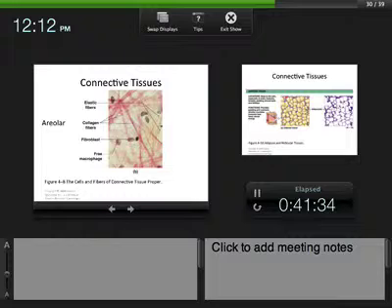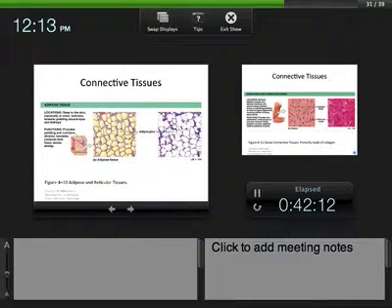We have fibroblasts, some macrophages. There's a whole host of different cell types that you're going to find. There's actually 9 different types of cells that are found in connective tissue proper, which is what loose and dense connective tissue is. So you'll see the range of them in the areolar tissue. Areolar tissue is distinctive by its open format with these large ropes of collagen and the thin elastic fibers running around with the scattered cells. Again, you'll want to take a look at it because that's a pretty poor depiction in this slide.